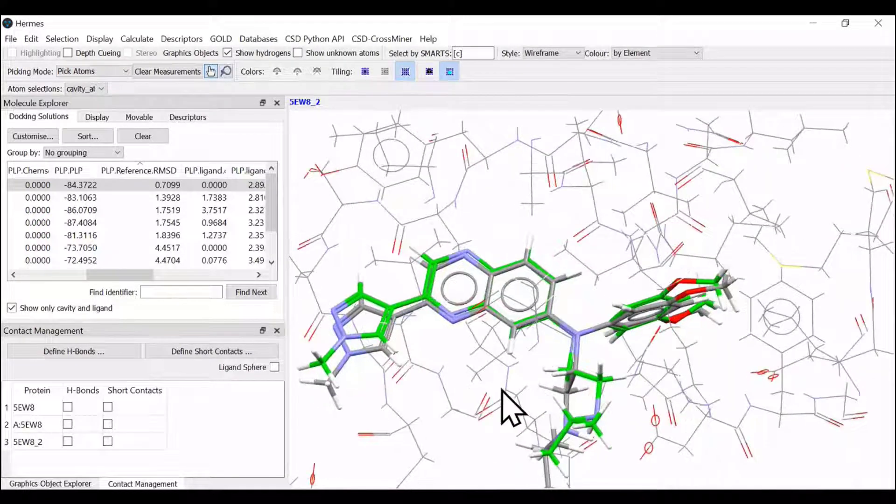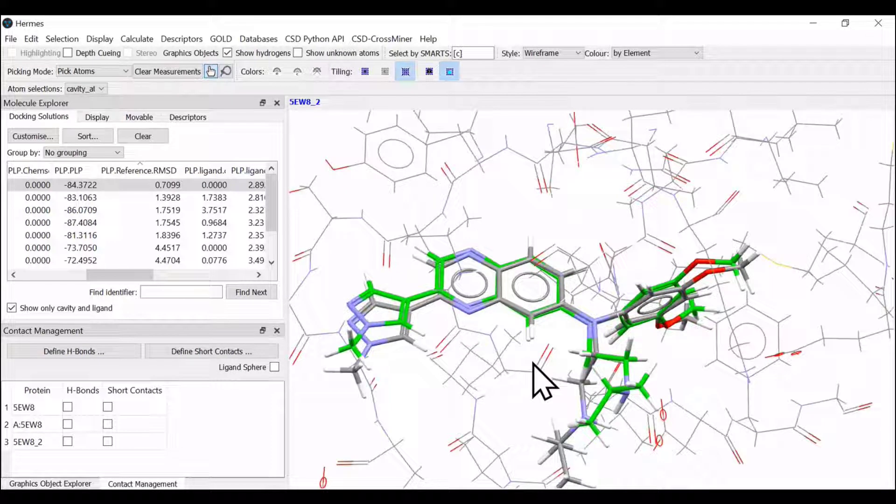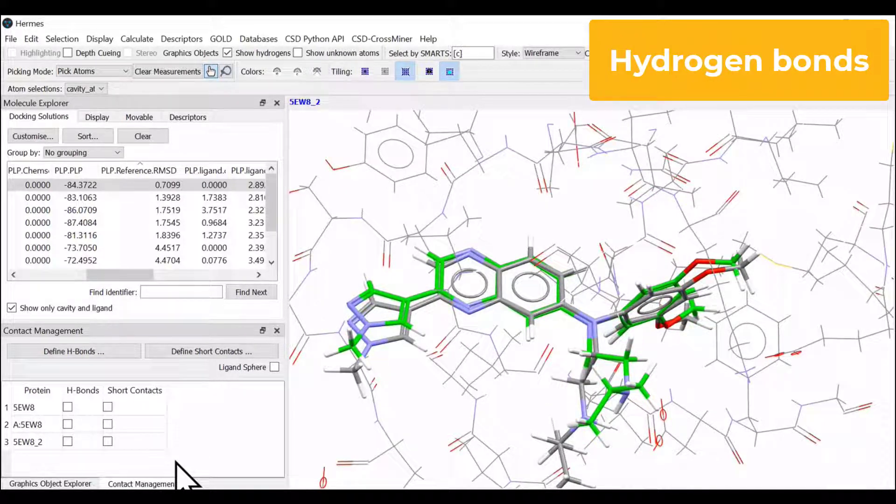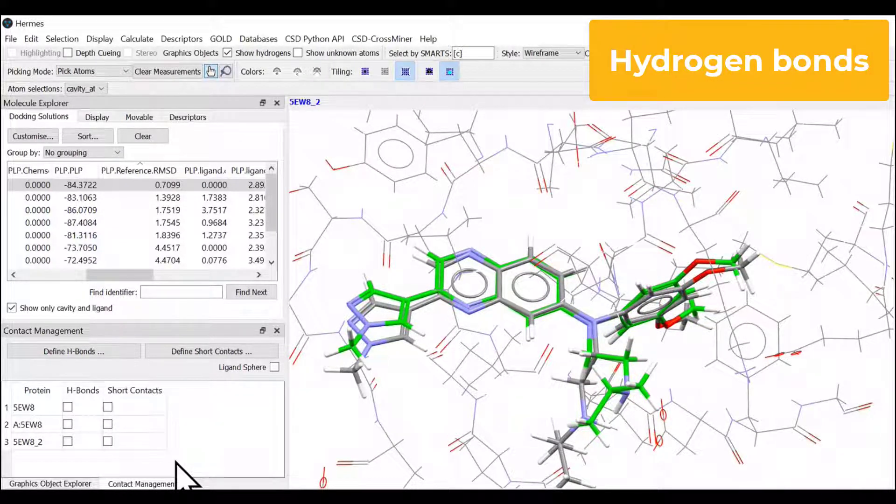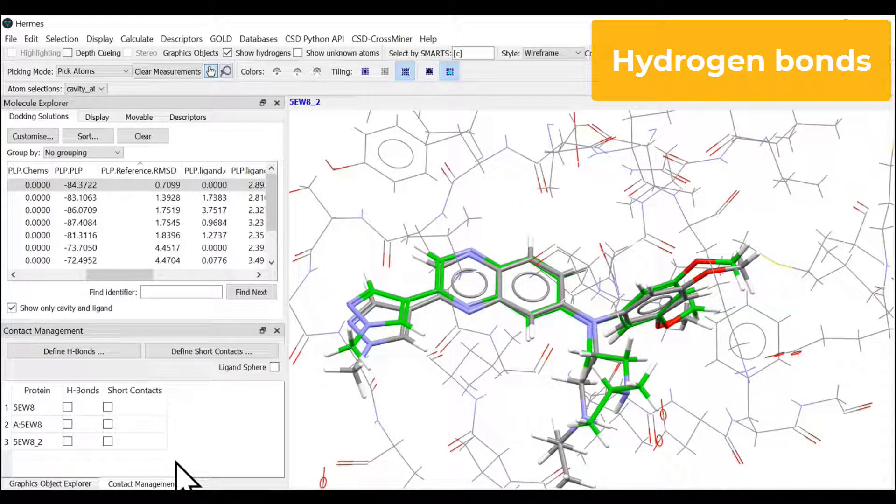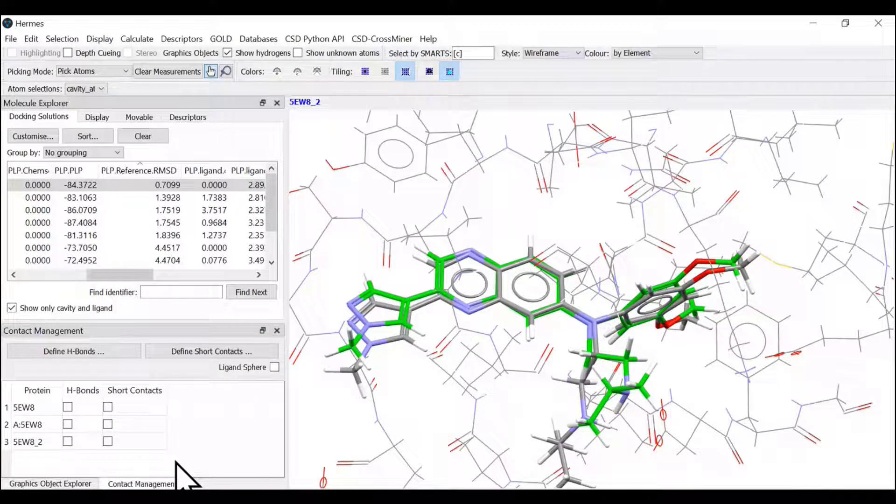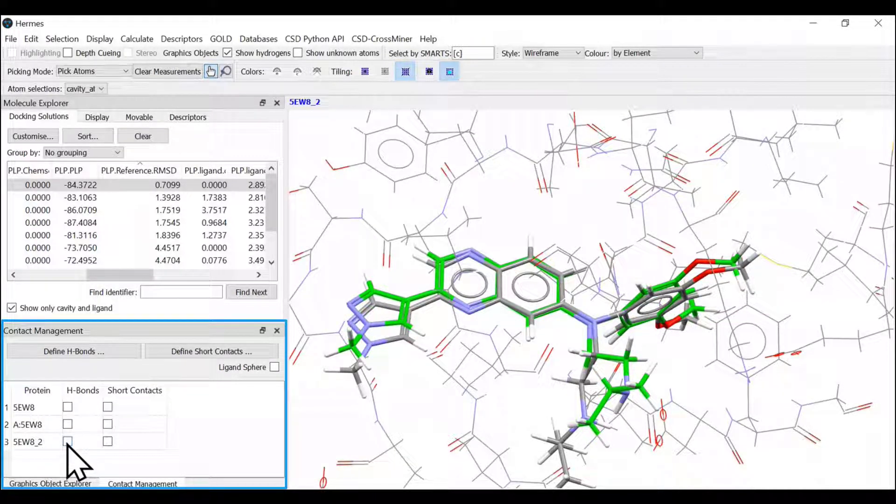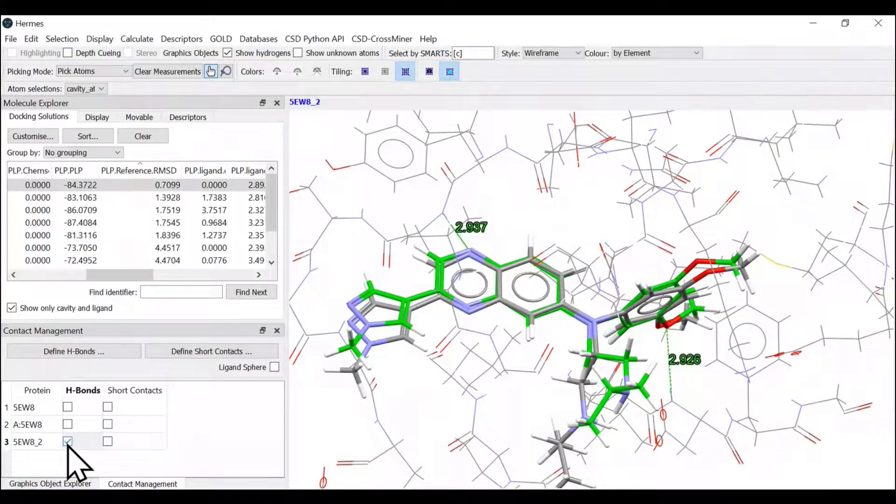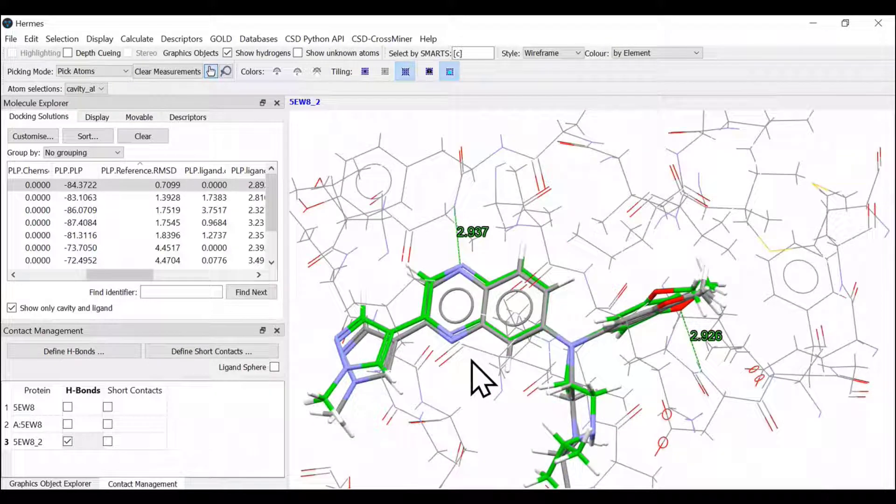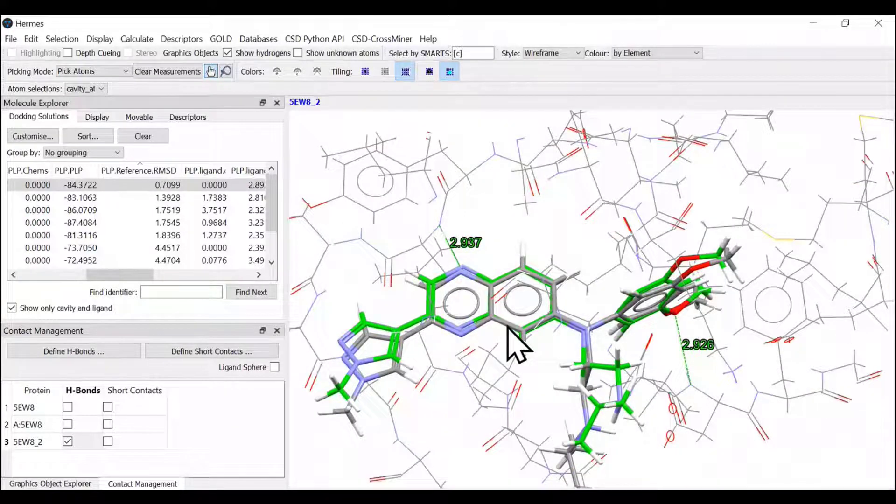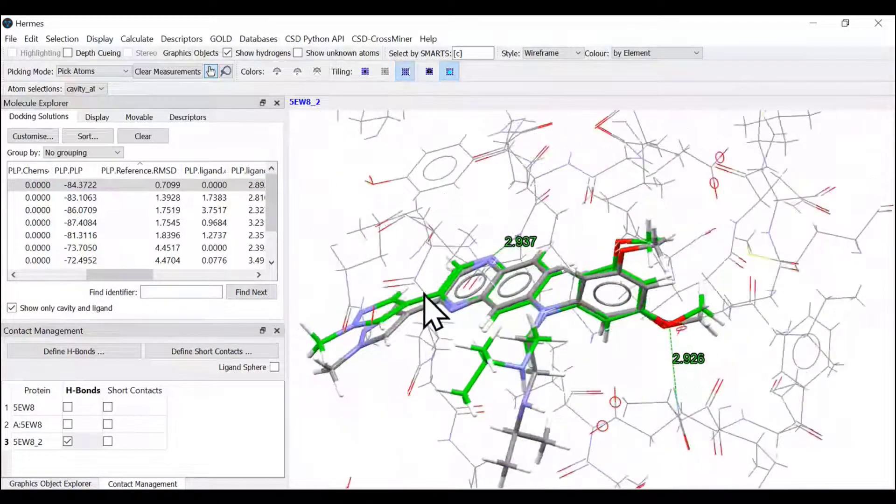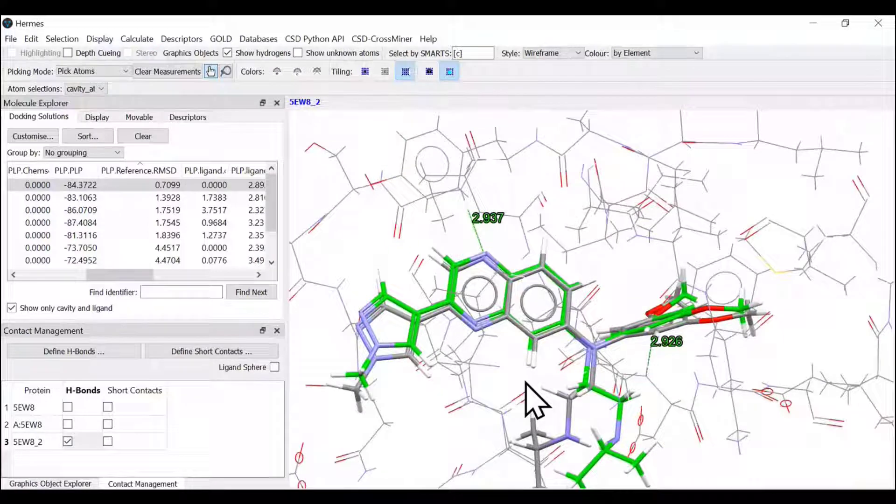Now what about the hydrogen bonds formed between this particular ligand and the receptor amino acids or the amino acids in the binding site? We can see or analyze them by selecting the contact management tab. We can select here and see what are the various interactions or hydrogen bonds formed by the docked ligand.